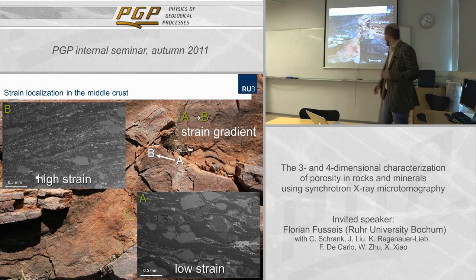I want to illustrate that with these two figures here. I collected this hand specimen, which covered that margin of the shear zone where the foliation is deflected, and here's the shear zone center. These are two micrographs taken with a scanning electron microscope, and you can see how fundamentally different the two microfabrics are. Here you can see a protomylonitic microfabric, K-feldspar, plagioclase, and unfortunately we cannot see that very clearly, but there are large, very prominent monomineralic quartz ribbon bands sitting in here.